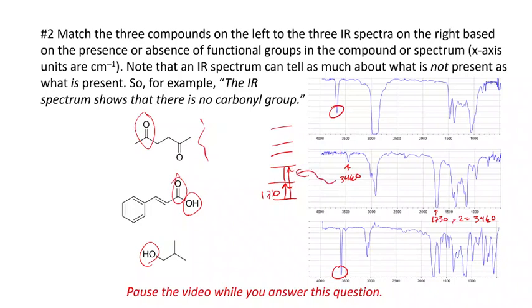We tend to see a small peak at exactly twice the absorption of a very, very strong peak if we have a very, very strong peak in the spectrum. So that's not really an absorption. It's certainly not an alcohol. It's something to check if you think you see that, to divide that by 2 and see if there's a really big peak and see if that's just what that is. I think here's another one. See this big peak down here, and we've got a little peak over here around 3500 in that other compound.